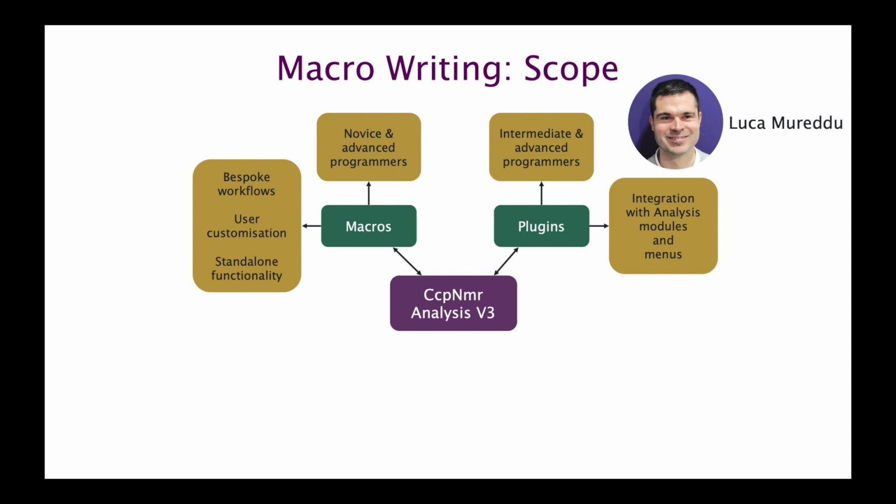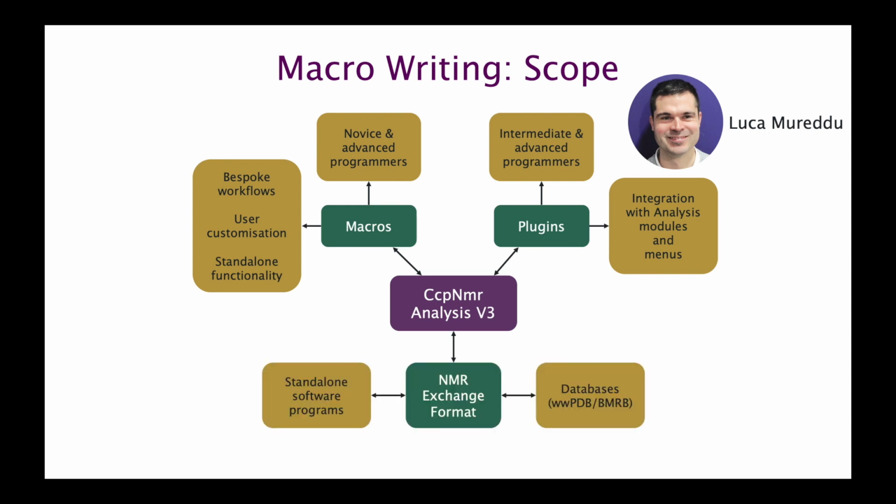If you're someone who's actually creating their own standalone software, but nonetheless you want to be able to move data from your program to ours, then obviously we'd recommend that you do that via the NMR Exchange format. That will also enable you to interact with other programs. Many others are now also compatible with the NMR Exchange format, and obviously also the PDB and BMRB databases. If you want to know anything more about the NMR Exchange format, then do get in touch with Elisa, who is our expert on that.